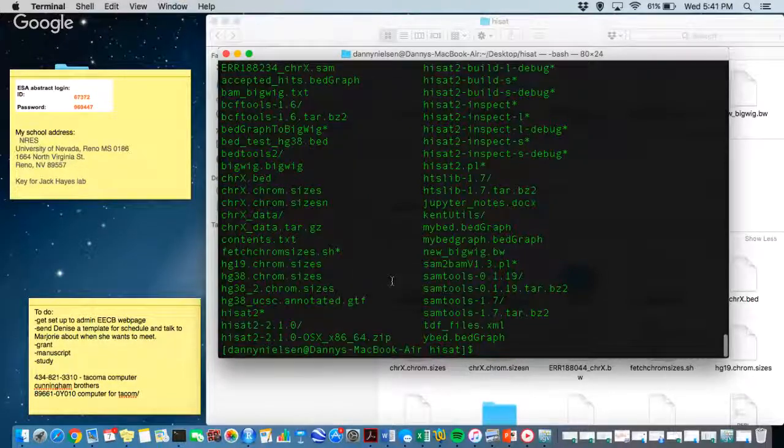What I've been doing in this whole process is copying all of the files and executables for these programs into a bin folder that I made in my user profile, and then I've set my path to run through there. So for a lot of these programs, I don't actually have to have the program in the same directory I'm working in. To show you, I'll list out the contents.